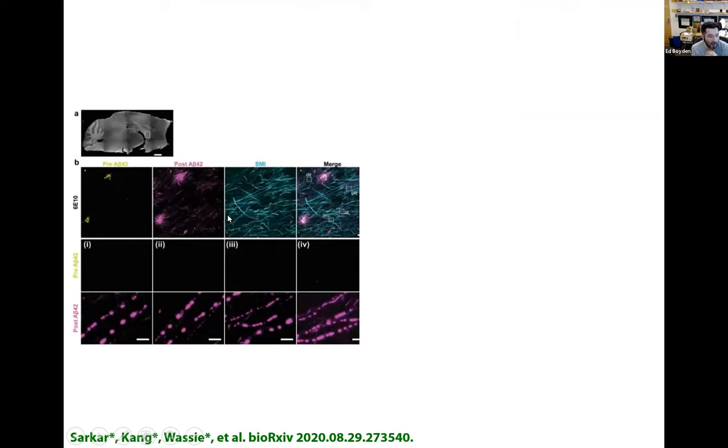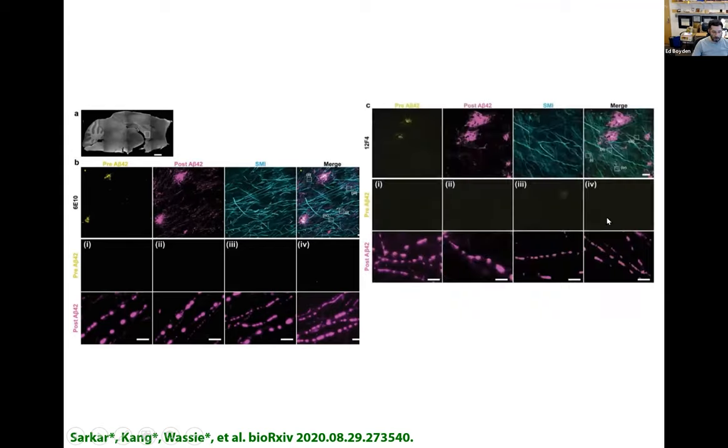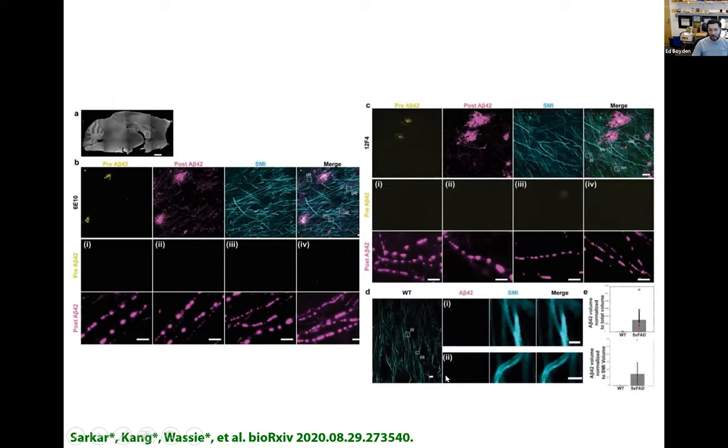Working with Thomas Blanpied's group, we looked at these nano-columns of coordinated pre- and post-synaptic proteins. We saw detailed coordination that were not uniformly distributed, but coordinated across the synaptic cleft, which might help with the precision of neural transmission. Working with Li-Huei Tsai's group, we looked at amyloid plaques in 5XFAD model mice. Yellow is pre-expansion, magenta is post-expansion. The purple images have more detail, and we even saw these amyloid dots, almost periodic structures. This held for two different A-beta-42 antibodies and we did not see them in wild-type mice.